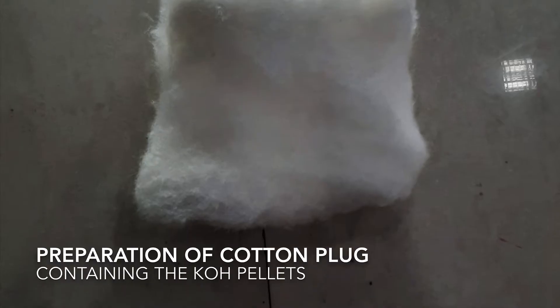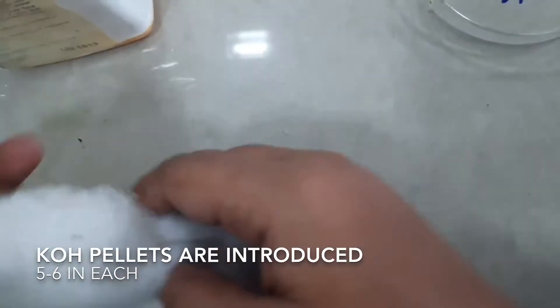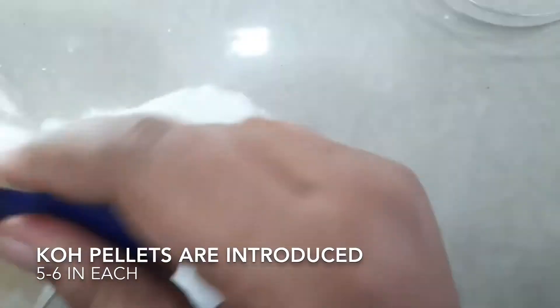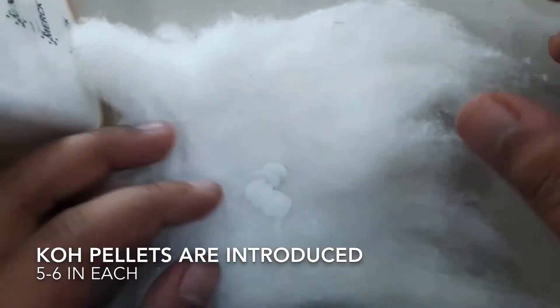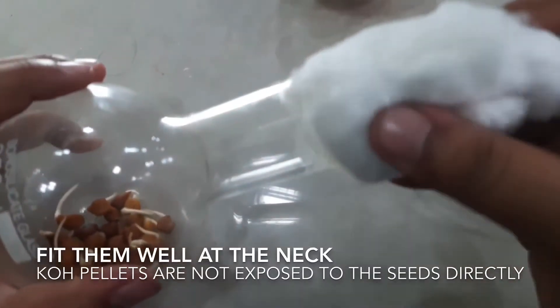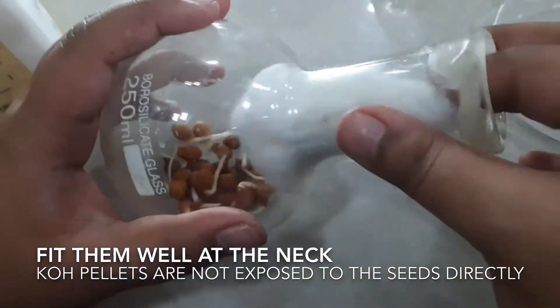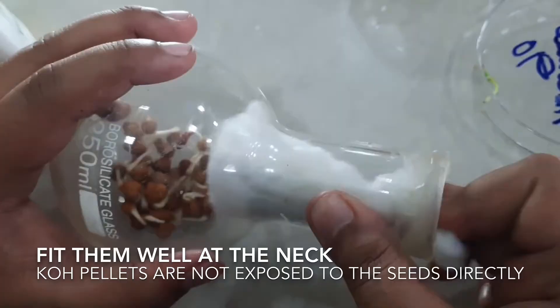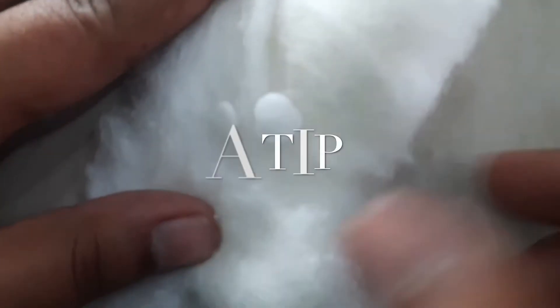A cotton plug is to be introduced into the neck of the flask. Make sure the cotton layer is not too thick and also not very thin. Ideally, we keep five to six pellets in each of the flasks — one containing the gram seeds and the other containing the flower petals. But sometimes for a proper result, we need some manipulations.